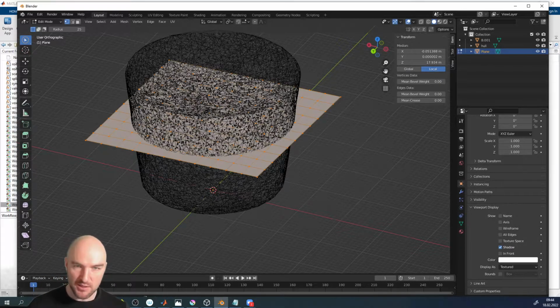Okay, so what are we going to do next? The next thing we're going to do is delete all of the mesh points that are outside of our data domain, because they don't make any sense. And I'm just going to do that using this circle select tool. So you can press C for circle select tool, and then I can mark everything that's outside.